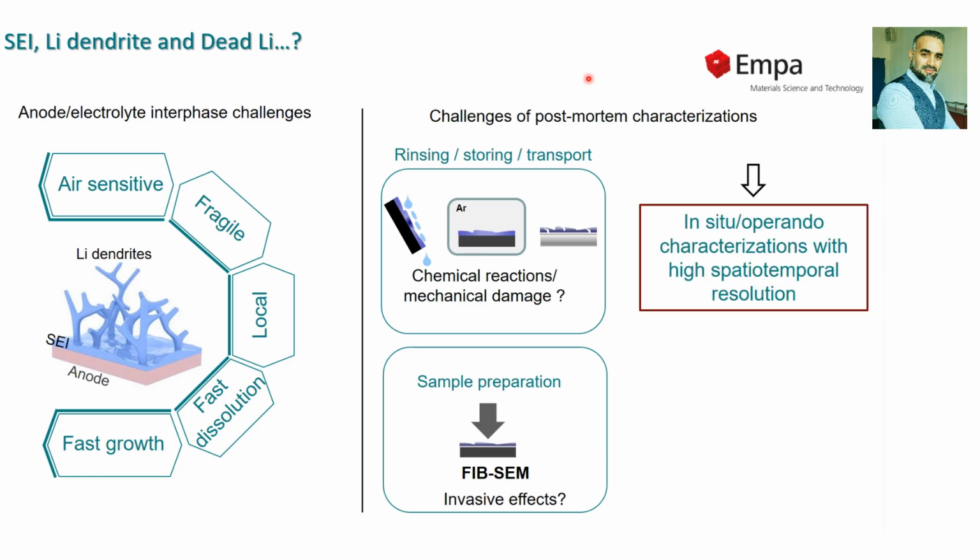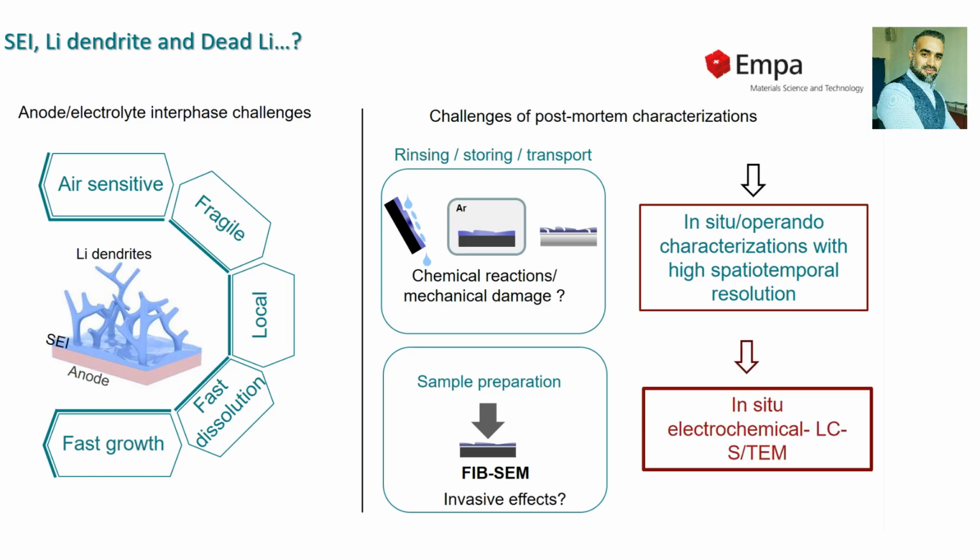For that, using in situ operando characterization with high spatio-temporal resolution will be the best way to study the mechanism of their formation. Here, we are using the in situ electrochemical liquid cell STEM technique.